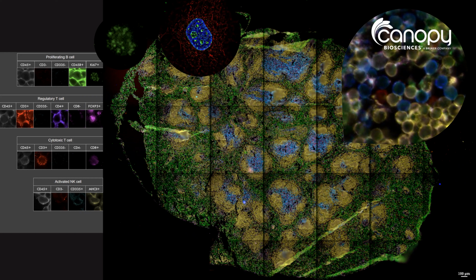It's not necessarily to say this is a game changer one way or the other. But I find it very exciting to give somebody the ability to do subcellular phenotyping and subcellular localization, which is pretty cool. And of course, we can also now do whole pieces of tissue because of the speed of the new instrument, which is pretty cool.